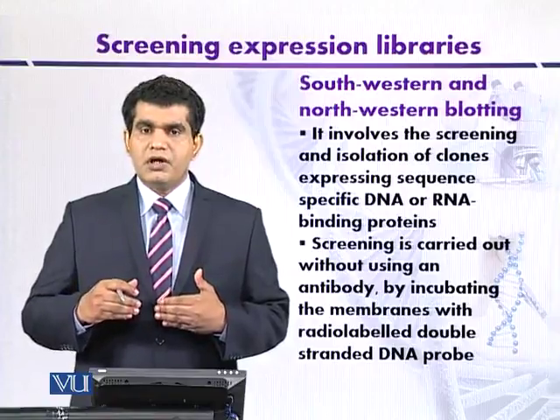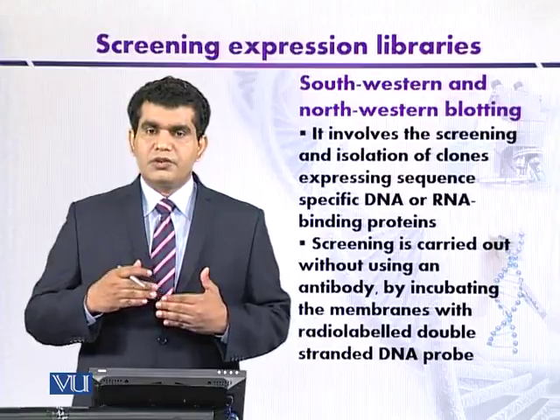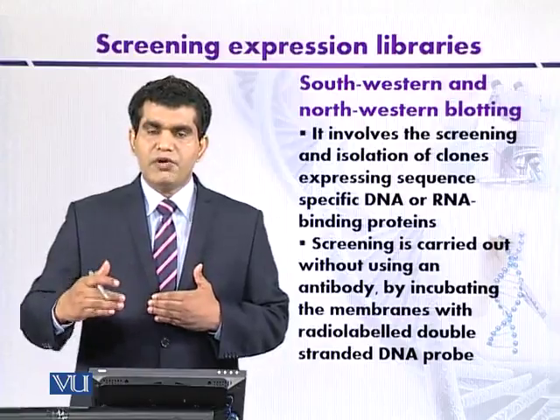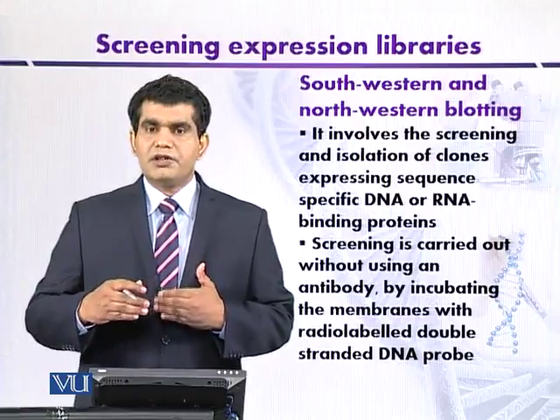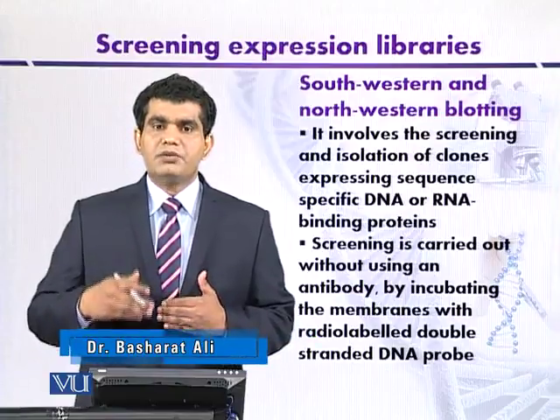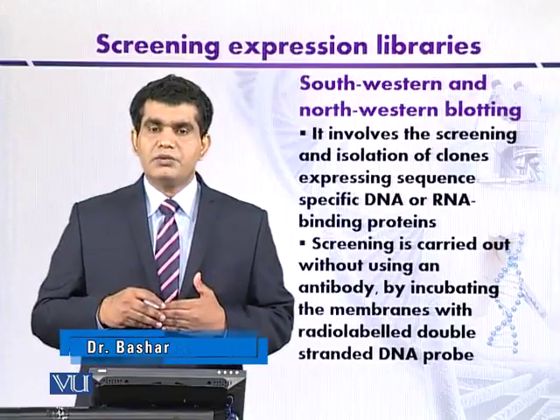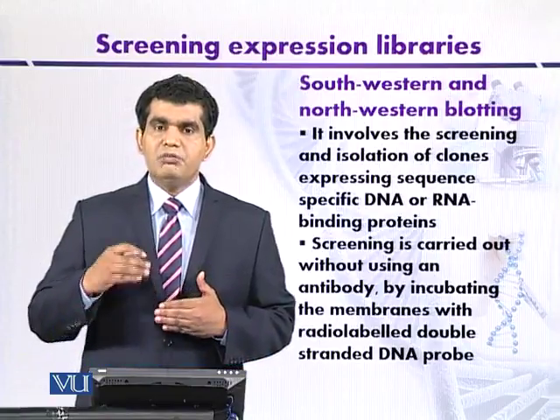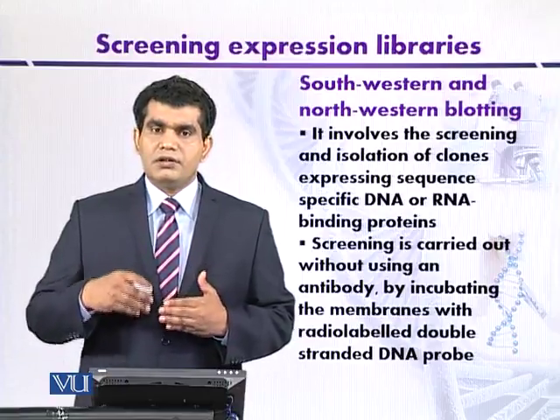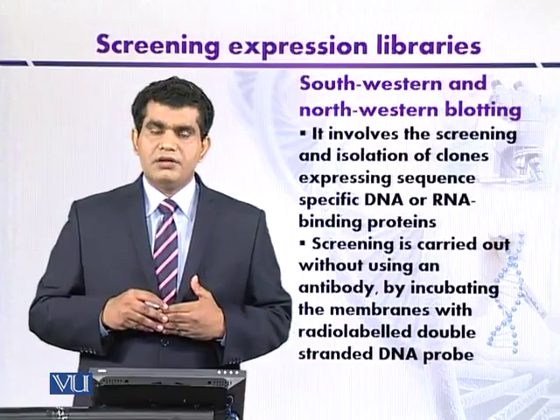सदर्न ब्लॉटिंग। इसमें हम डीएनए को एग्रोस जेल पे रन करते हैं सो दैट द फ्रैगमेंट्स बी सेपरेटेड, so that they may be purified finally, and the separated DNA fragments are shifted to nitrocellulose membrane, and after shifting to nitrocellulose membranes, they are immobilized, and then by using a specific probe, by using the hybridization method, the target sequence is detected.